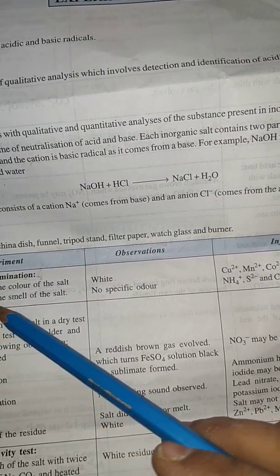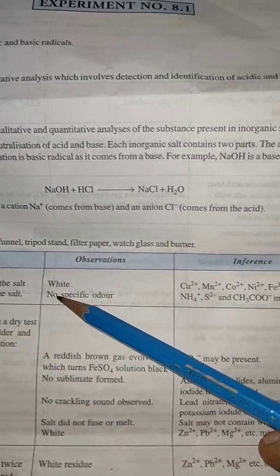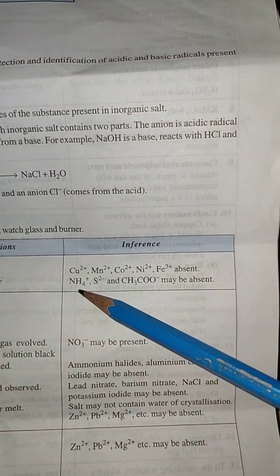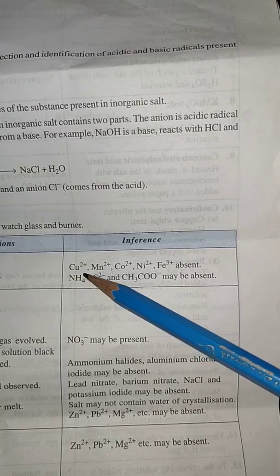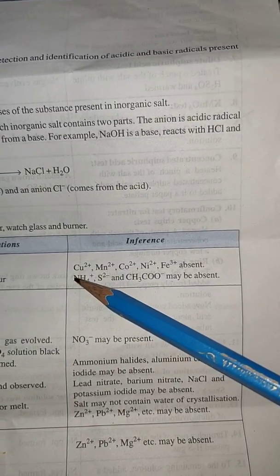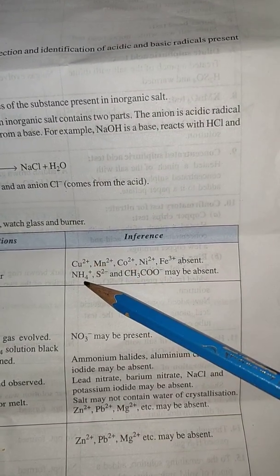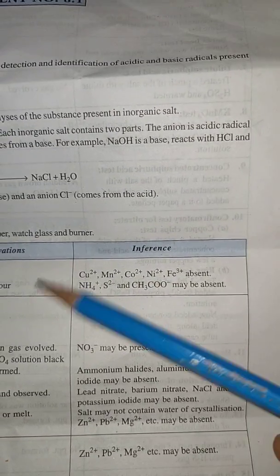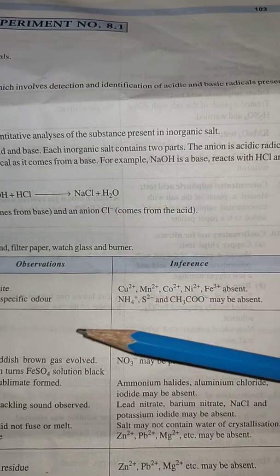Come to the second part of physical examination: observe the smell of the salt. No specific odor, because some specific odors come from ammonia, sulfide, acetate like vinegar smell. This is the way how to write the salt analysis practical in your lab manual.